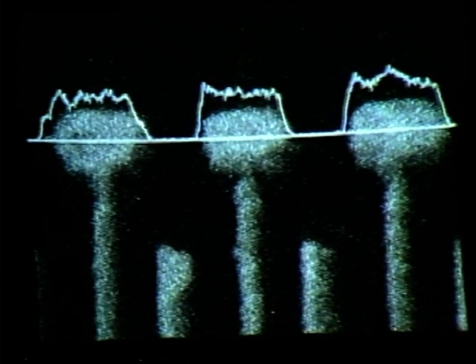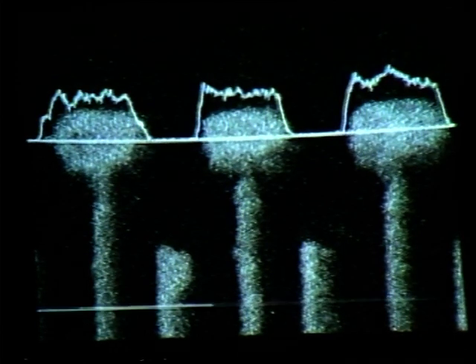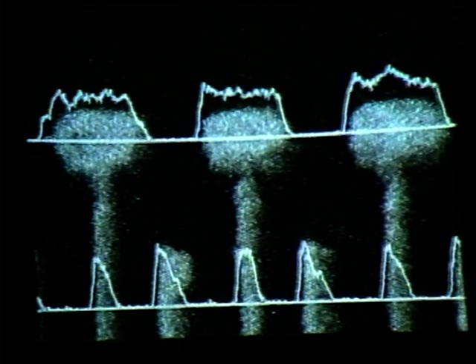Let's also superimpose line number 3, region number 1, do a display add, which is now soft key number 2. And again, we see a nice correlation with the gold map and the corresponding gold line scans.